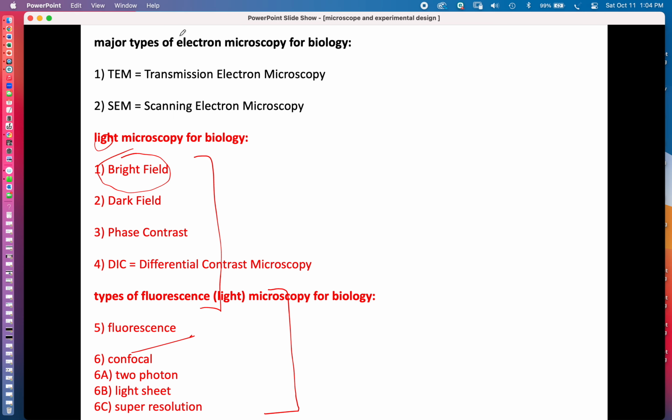These are all electron microscope tools. Electron microscopes are really expensive, and they're just not very common because they only have specialized uses. These microscopes can be all expensive. These start to get extremely expensive, $500,000 like that, and very fancy imaging. They'll typically collect a digital image, and that matches up really well with a computer's ability to store that information and analyze that information.